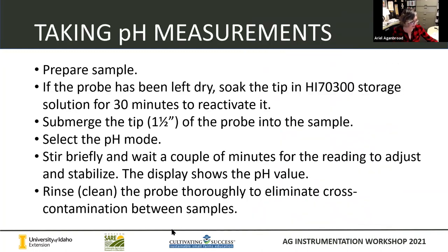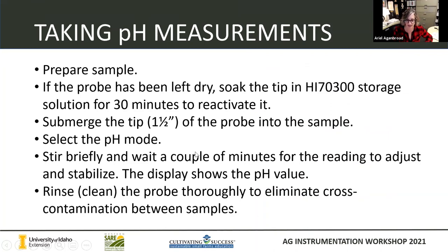So how do we take our pH samples? If your probe has been dry, refresh it in the storage solution. Put the tip about one and a half inches into the sample, select pH, stir it around a little bit, wait a couple of minutes for the reading to adjust and stabilize, and it's going to show you the pH value. Then if you're going from sample to sample, you'll want to rinse and clean that probe thoroughly with water to eliminate cross-contamination.